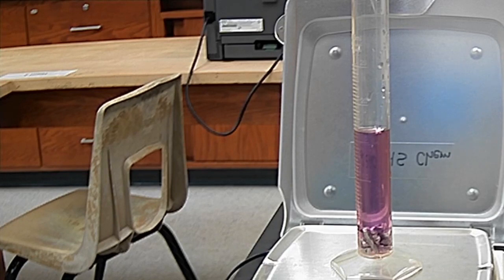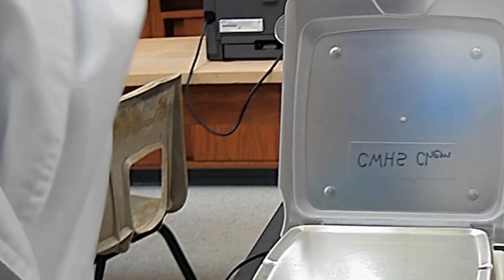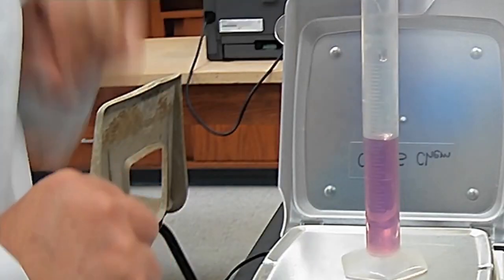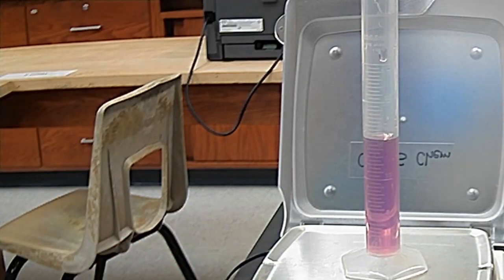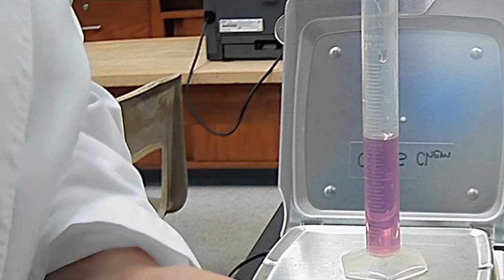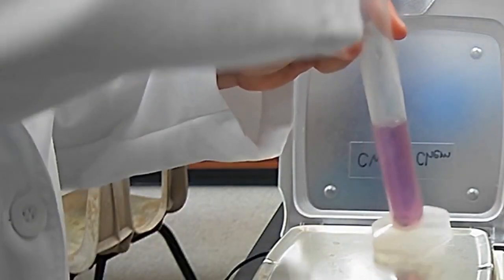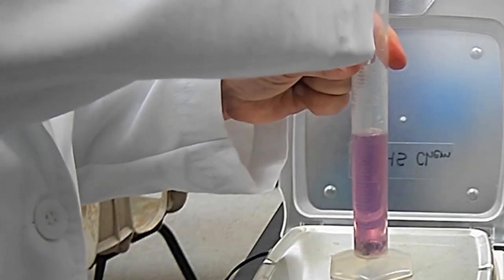Okay, and think about significant figures when I'm doing this as well. All right, our third one we're going to use, again, is 15 milliliters. So this is metal A, trial 3. And our beginning mass is 29.7. So we're starting at 29.7, okay? Now we're going to add our sample here of our metal. We're going to add that in, try to not make a mess, because I don't want anything to splash out, or I could have a higher experimental error than I would like.